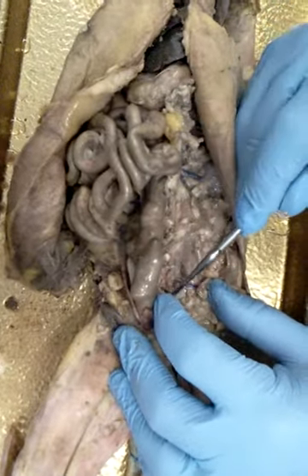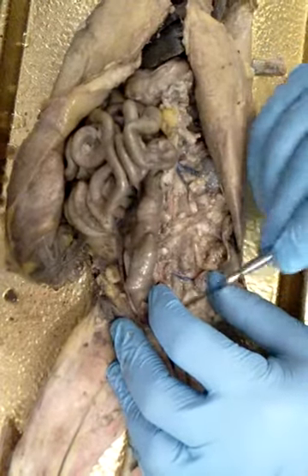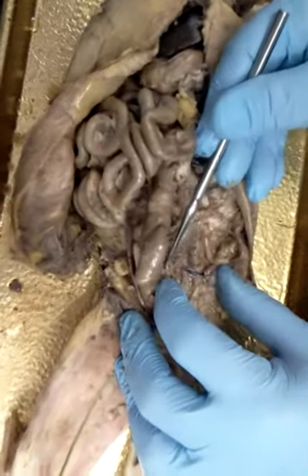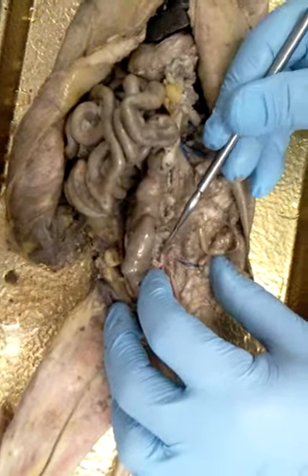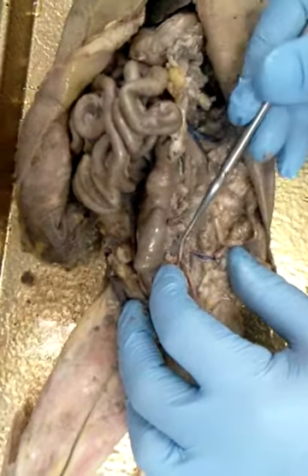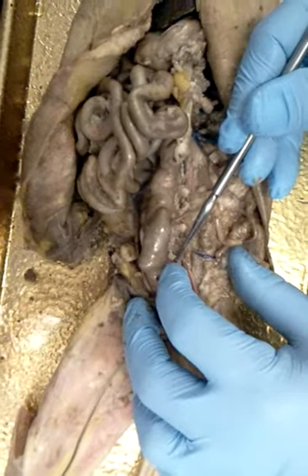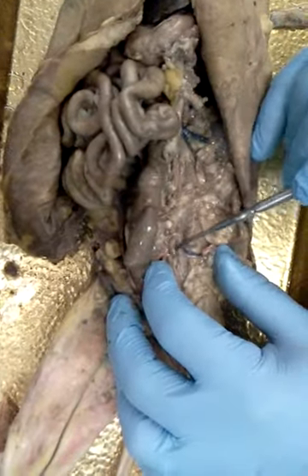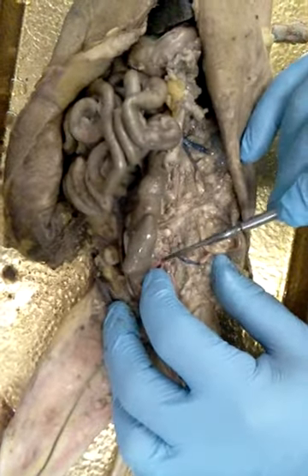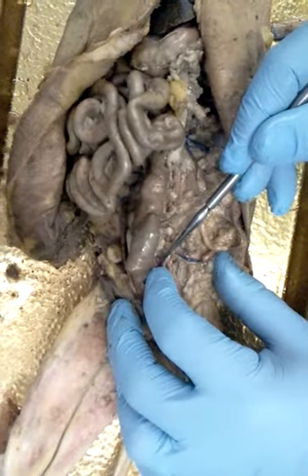Then we're going to come to the arteries that are going to branch. There's 2 sets. There's an external iliac and an internal iliac. The external iliac is on top and a little larger. The internal iliac is a little bit smaller and goes down deep, okay, into the body cavity. Can you see the difference there? See the V's? There we go, okay? External iliac, internal iliac, all right?